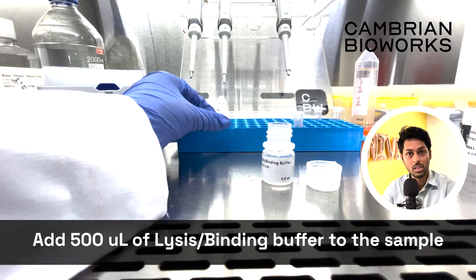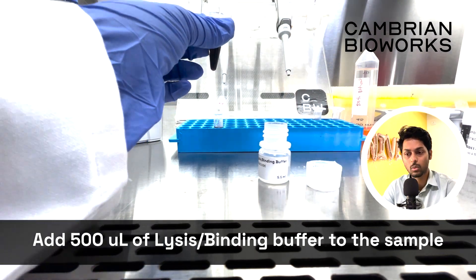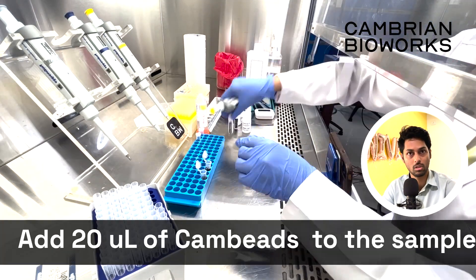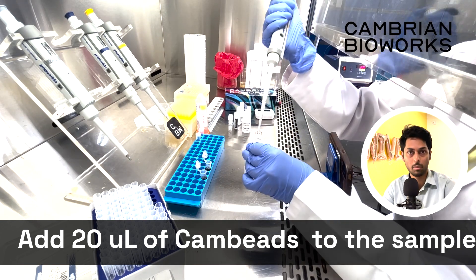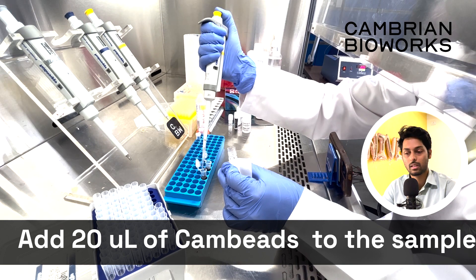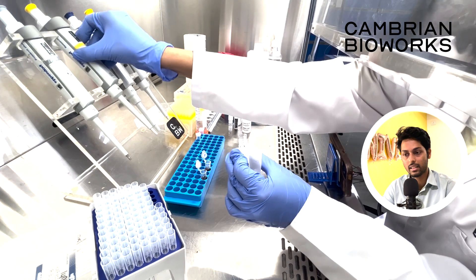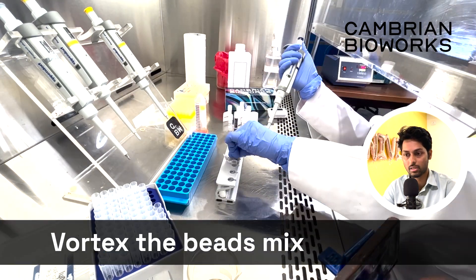Once the incubation is done, add 500 microliter of the binding buffer to this, and another 20 microliter of CAM beads to the solution. CAM beads are the magnetic beads that will hold all the DNA in place and help you keep the DNA clean and purified for the end reactions.